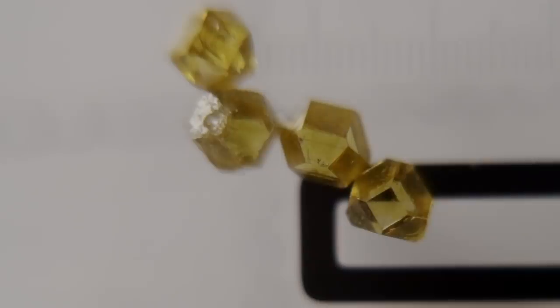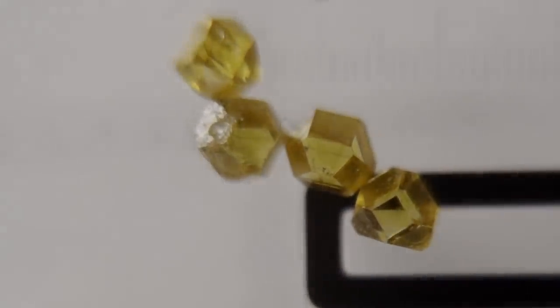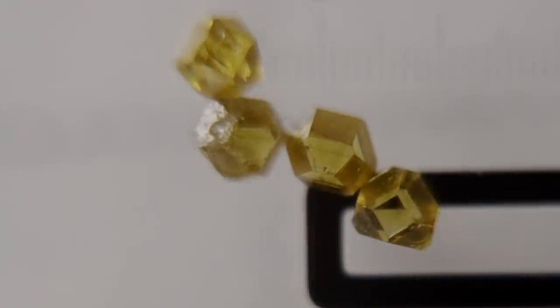And it's quite challenging to do on several fronts. First of all, to get diamonds to burn, you've got to get them up to about 1,000 degrees, and then you've got to give them a pure oxygen atmosphere. So how do you heat these things up to 1,000 degrees without blowing them around all over the place? I mean, it's dead easy to get things up to 1,000 degrees. You just put them in an oxygen propane torch or something. But if you can't do that, how are you going to do it?